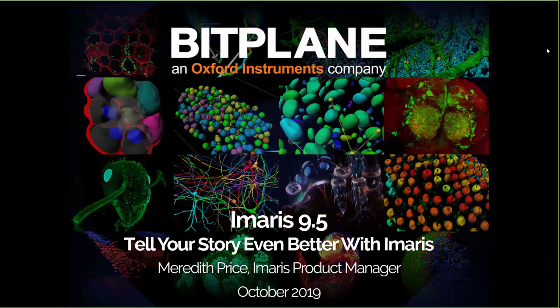Within this release, we've made several improvements that should help your work stand out and be eye-catching, and to really allow your images to tell their story even better. And so we decided to make these specific improvements, because we know that telling the story of your images and the story of your experiments is really like selling your own work.